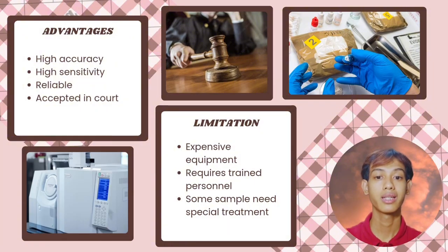Overall, despite these limitations, chromatography remains one of the most important analytical techniques in forensic science because of its high accuracy, reliability, and ability to provide strong scientific evidence.